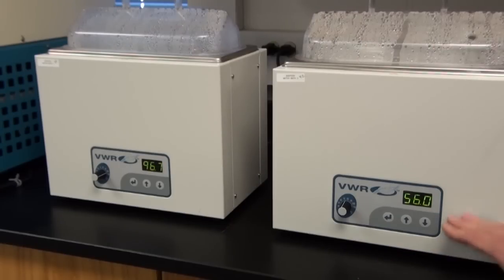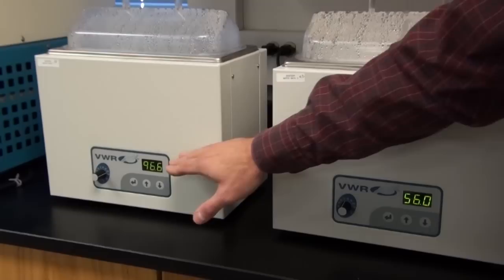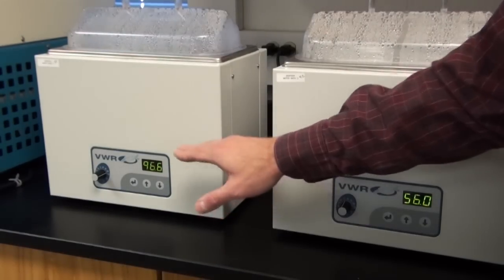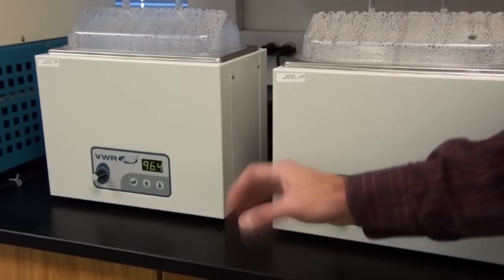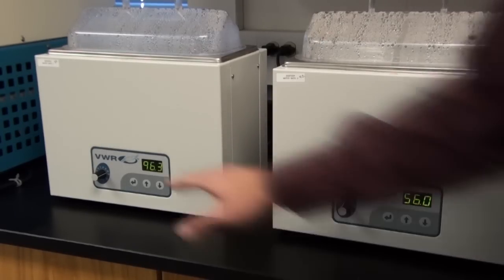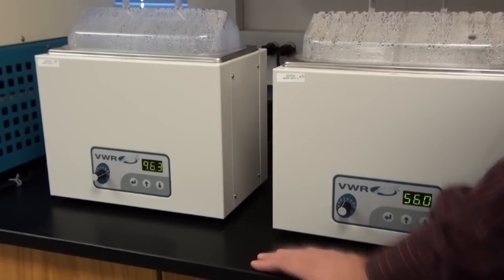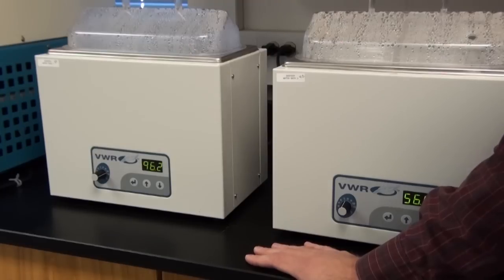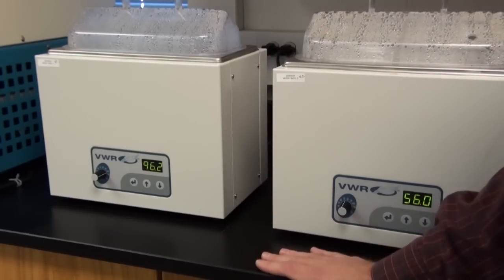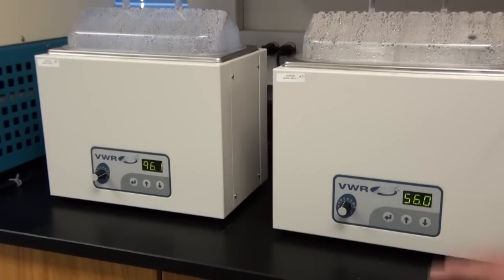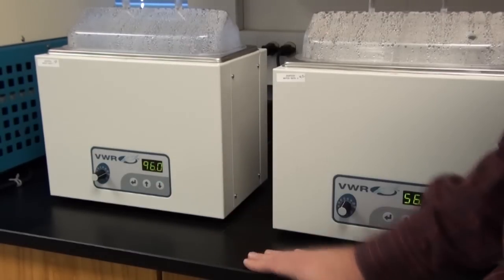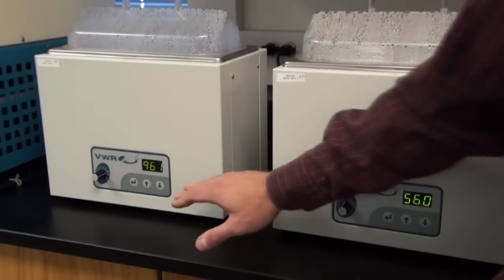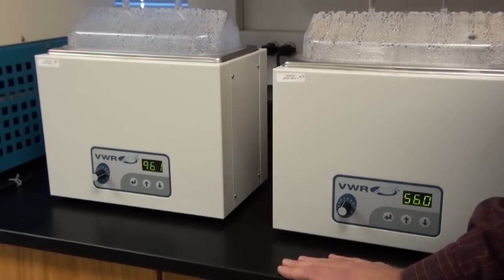At a later subsequent step, you want to actually break the cells open because you need to get through the plasma membrane or the cell membrane and also through the nuclear membrane to release your chromosomal DNA. By approximately boiling it, you can bust those cell membranes open and that will enable you to release the DNA. You're going to see a 56 degree water bath and also a water bath at approximately 100 degrees Celsius. Those will be used to dissociate the cells and then eventually lyse or break open those cells.